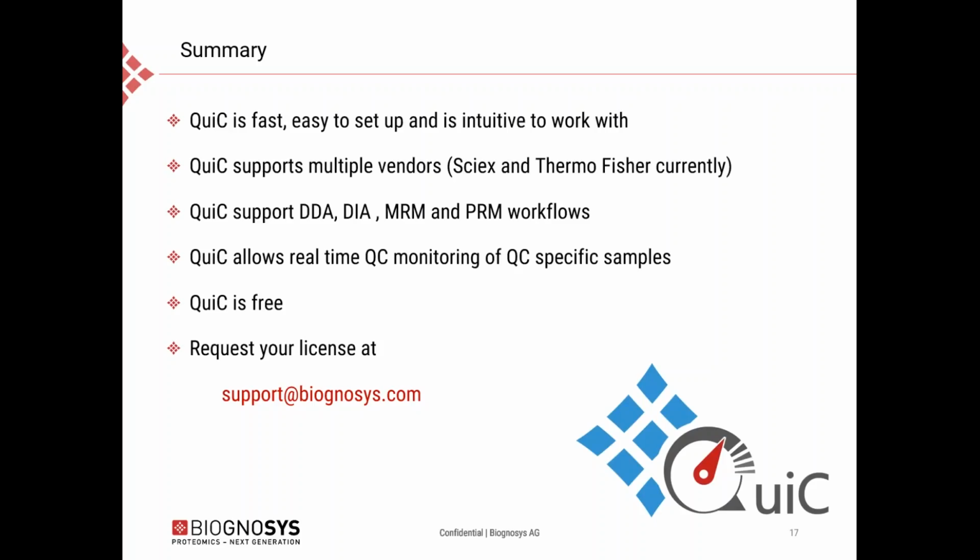It allows you to do real-time QC monitoring of specific QC samples, or it also allows you to analyze all your MS files from a certain experiment to perform QC analysis and to determine which samples can be excluded. Last but not least, QuiC is free of charge. It only requires the IRT peptides to perform certain analysis. If you wish to request your own license of QuiC, just send us an email at support@biognosys.com.